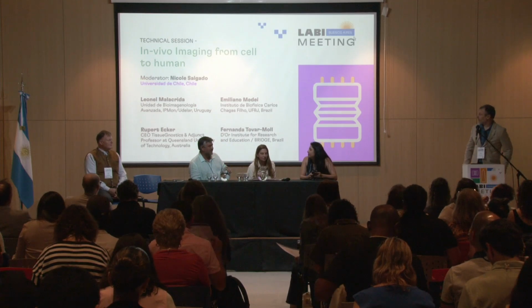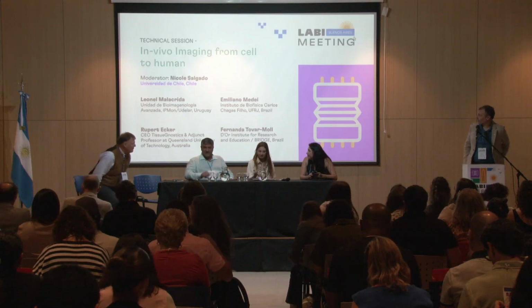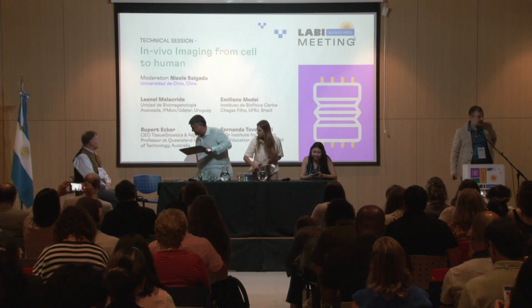And today I'm going to talk about a technology that we have been developing for the past couple of years in Uruguay, the DIVER microscope.